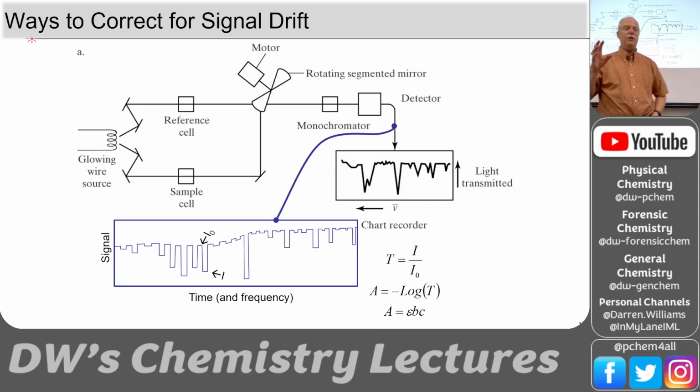So this is a way to get rid of that drift. Go real fast and make a bunch of measurements. Okay, now that's not going to be good. You're going to spill your liquids. Okay, so don't move the samples, move the beam. And that's what the chopper does. It's up there, that rotating mirror sends the reference, then the sample, then the reference, then the sample to the detector. And you get a really ugly signal. You get this chopped signal.